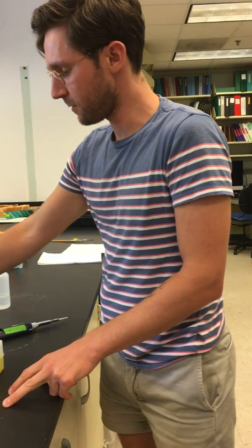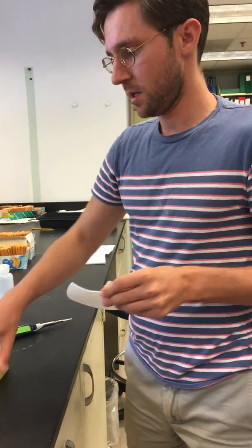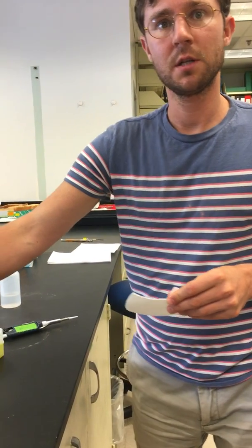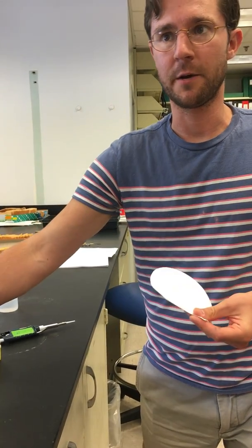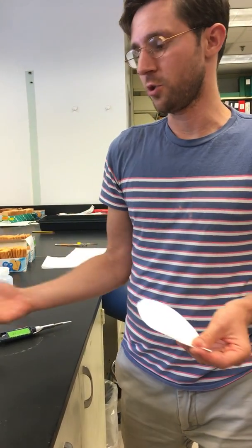So the first thing is to germinate pollen in a drop of this solution. It needs to be in a moist environment so the solution doesn't dry out. If this dries out, you'll get no germination.